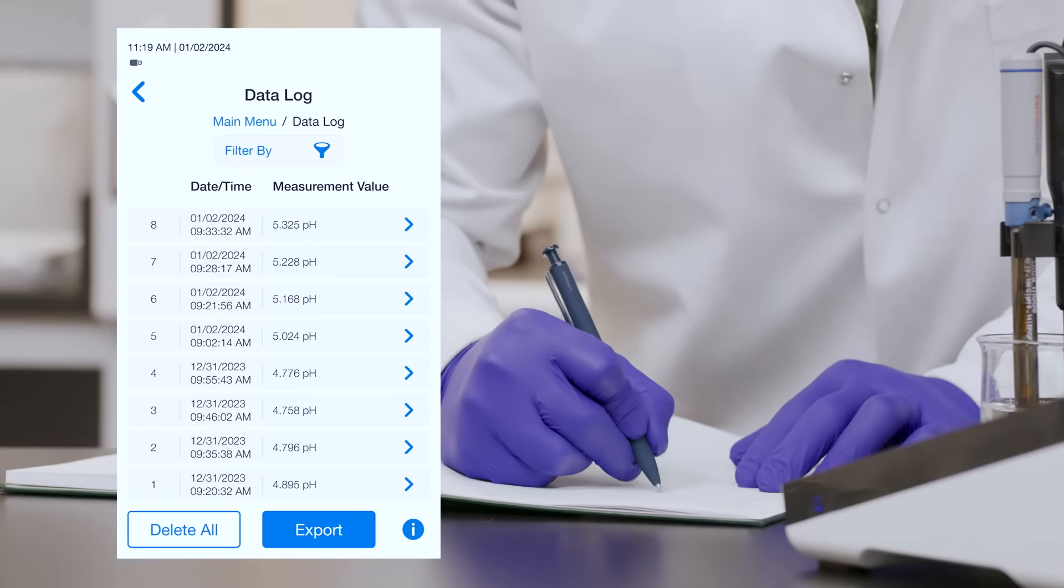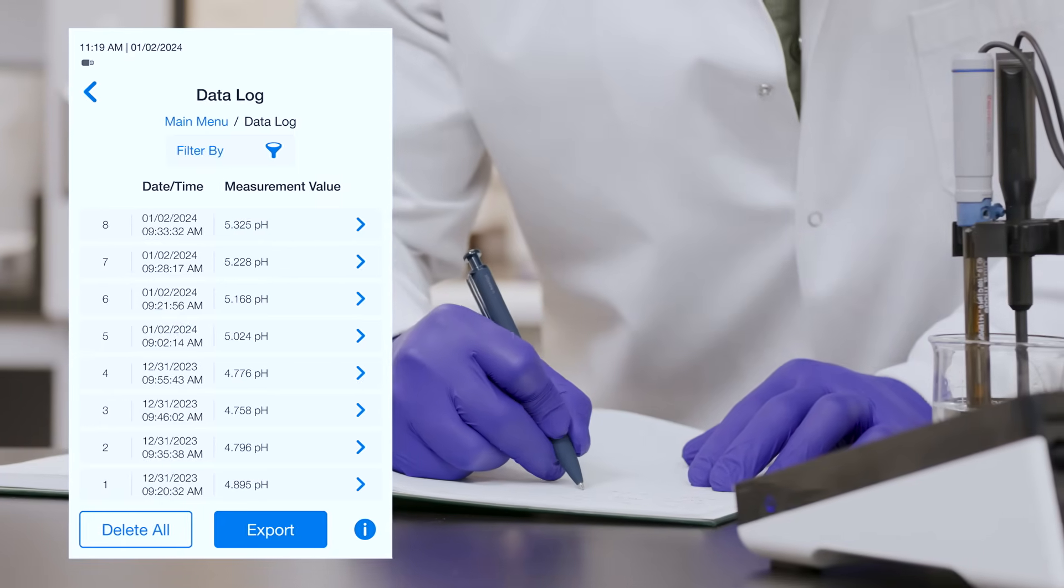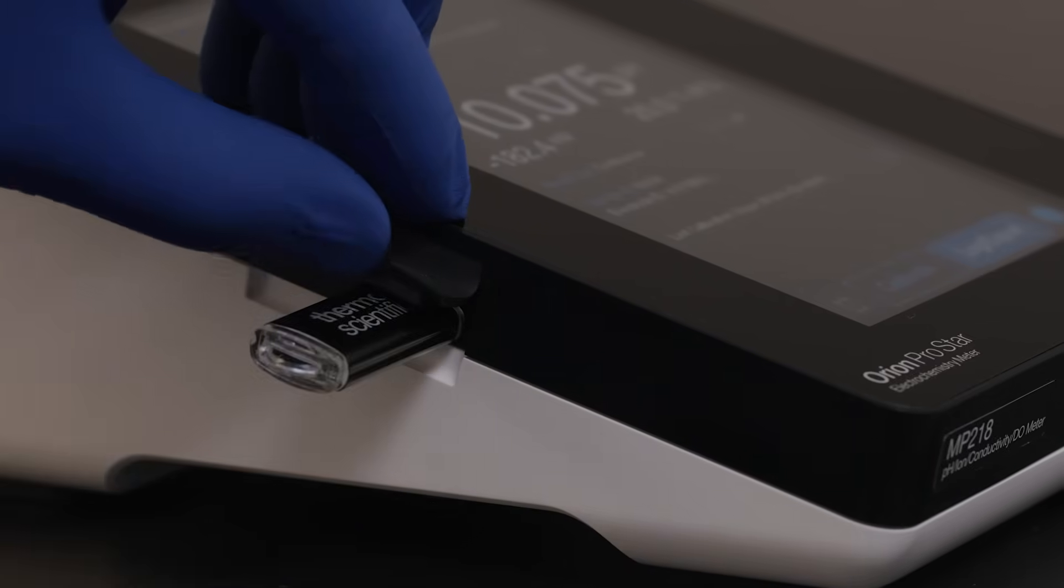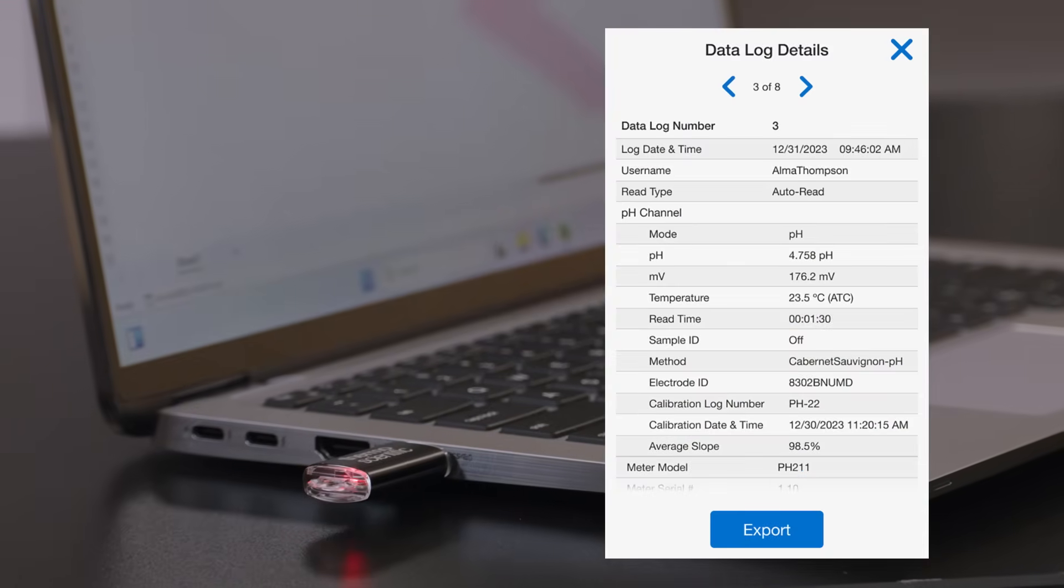Once your analysis is complete, data is easily logged and stored with date and time stamps for GLP compliance. And when you're ready, data logs, calibration logs, and methods are all seamlessly exported to a printer, computer, or USB flash drive.